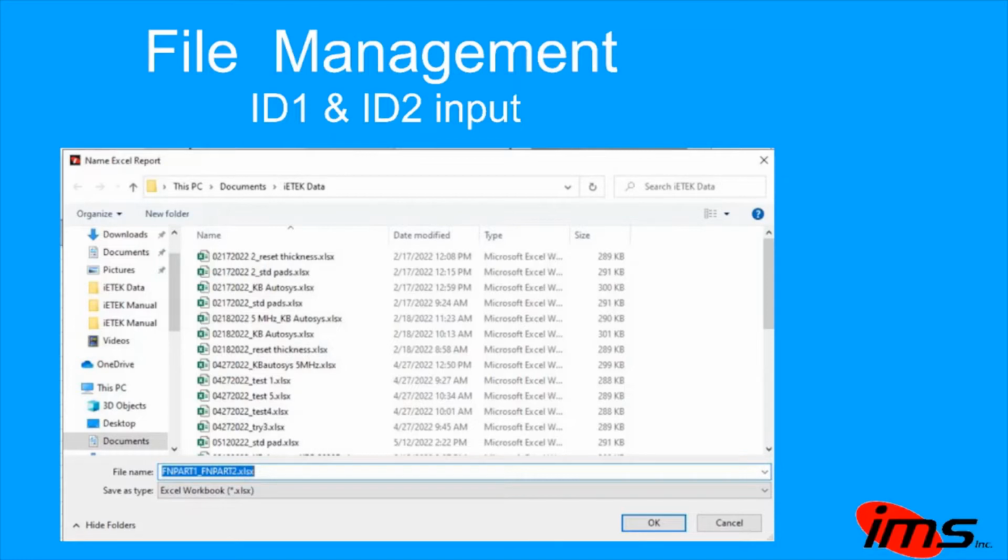This is the file management box. This box appears when the first measurement is made. What it does is concatenate the ID1 and ID2 user inputs, and that's used to form the file name.